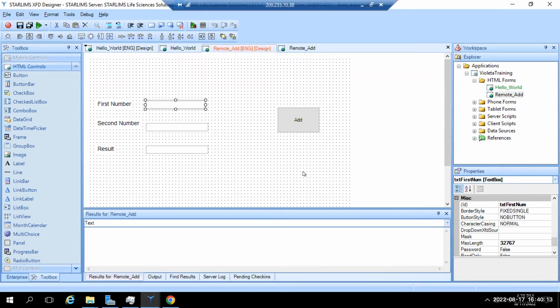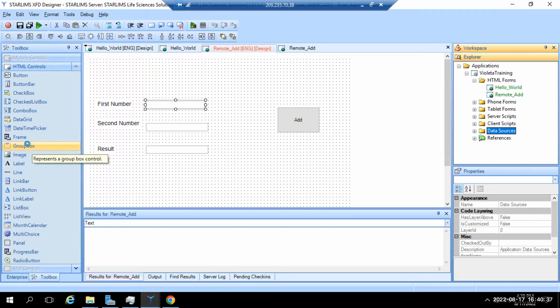Like today was nice. I think you guys got good content, but I mean, yeah, it's not enough, right? So yeah, and then you need to practice on top of that. But yeah, we'll continue on Friday with some more of the back end stuff, right? So we've only spent a little bit of time here, but we have server scripts, data sources. So that's it. Thank you, Ronald.